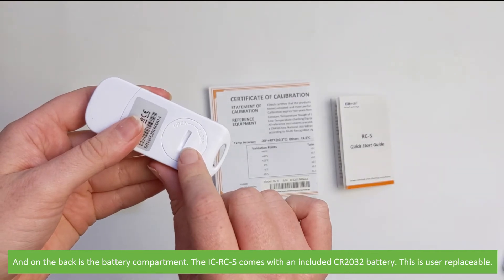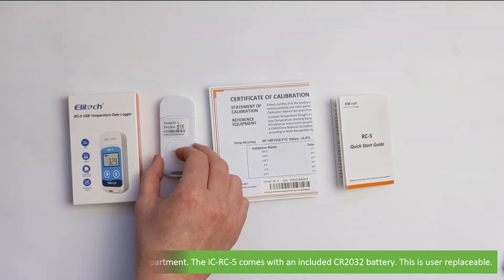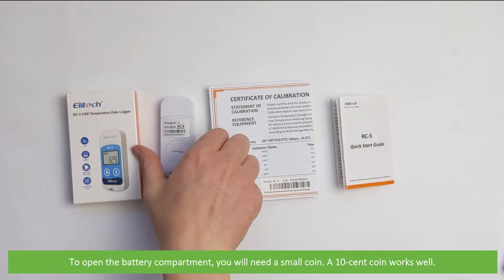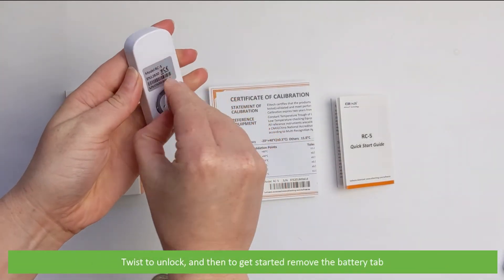The ICRC5 comes with an included CR2032 battery, which is user replaceable. To open the battery compartment you will need a small coin — a 10 cent coin works well. Twist to unlock and then to get started, remove the battery tab.